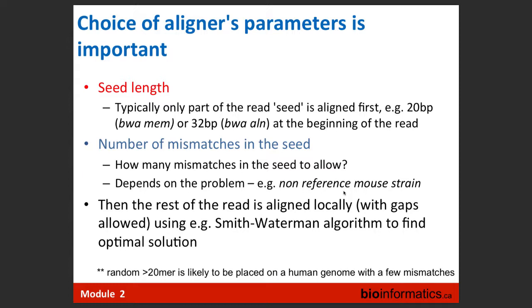I think now the kit is just 75, even the smallest, even 100, right? The question is not why it's cheaper. Why do 125 if you're not going to align it? But you are. The seed region is different from the read itself. It's the extension, right? So we align the seed first, then we extend. And that's where the 100 comes in.